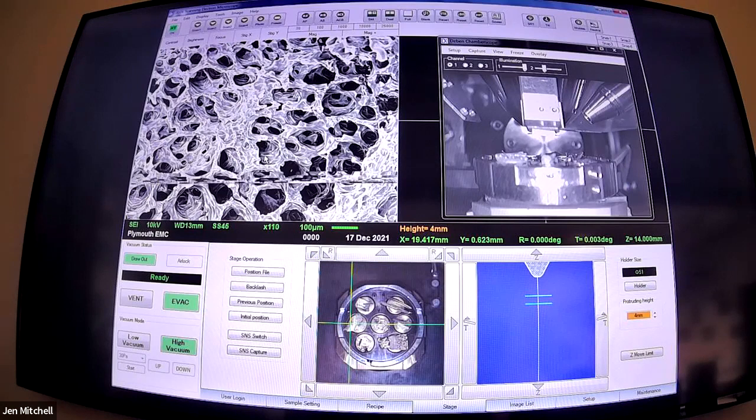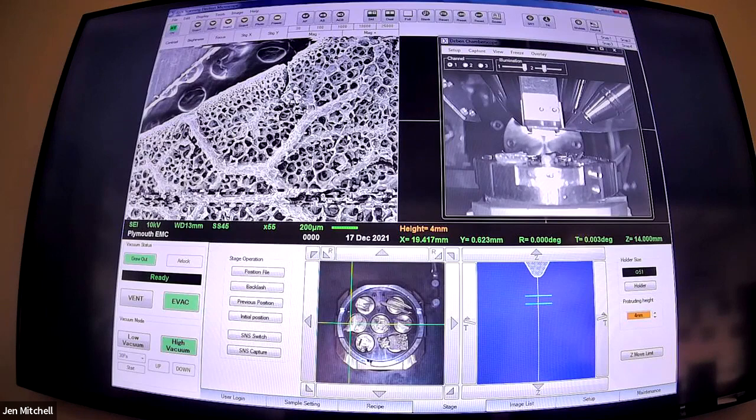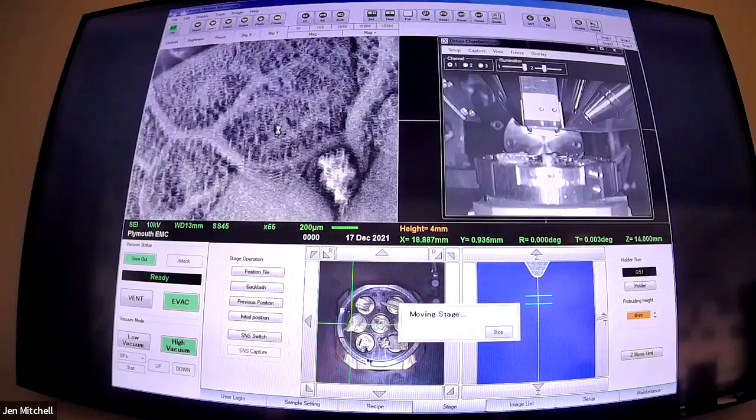Secondary electrons - you can describe them as like you're looking at a sample on an overcast day. That's the sort of contrast you get. Elaine has nailed it - isn't it Holly? What a good start. It's a holly leaf.